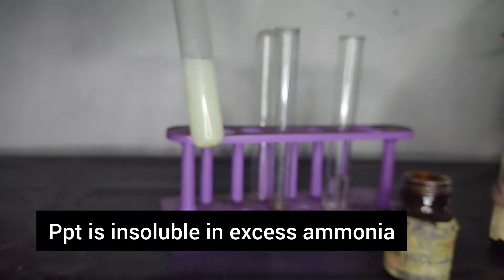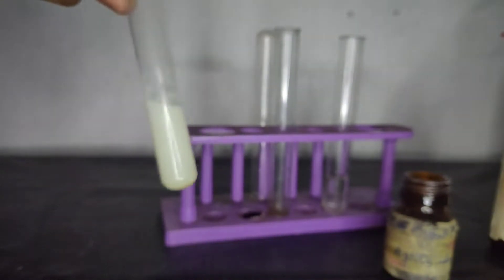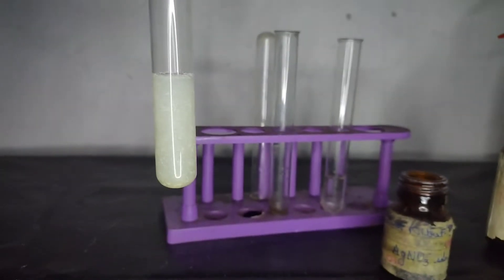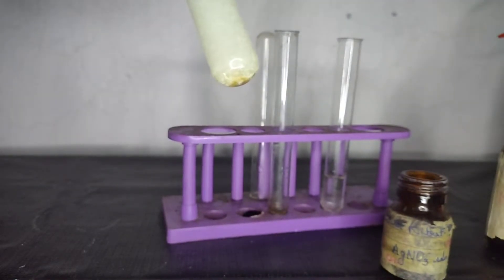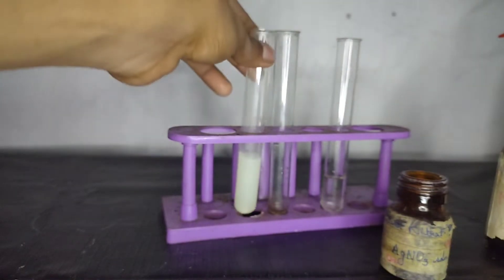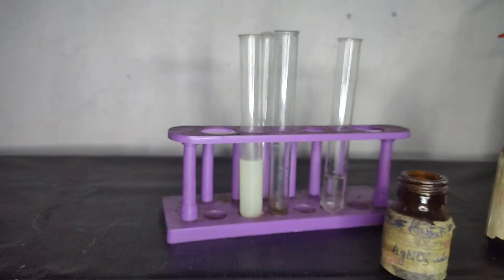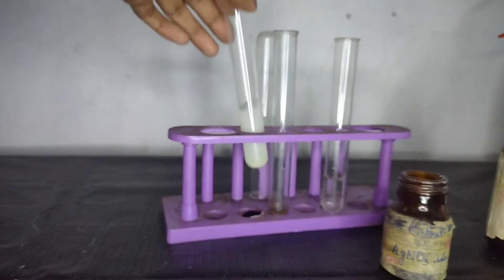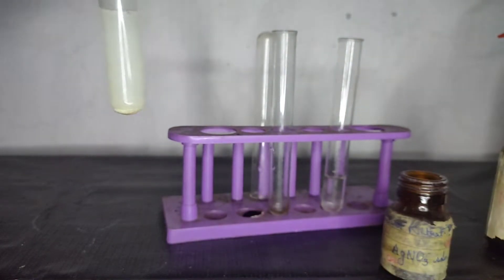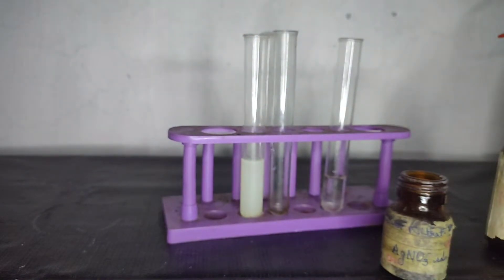On adding ammonium hydroxide in excess, you can see that the precipitate does not dissolve at all. Even if you add potassium iodide to silver chloride dissolved in ammonium hydroxide, it gives a precipitate of silver iodide. Because silver iodide does not form complex with ammonia like silver bromide and silver chloride.